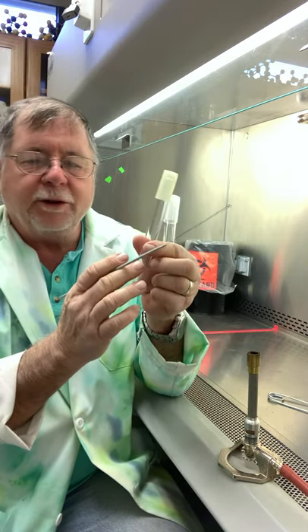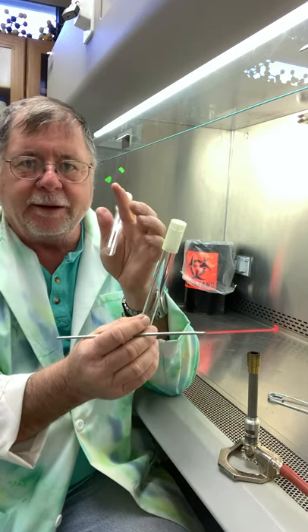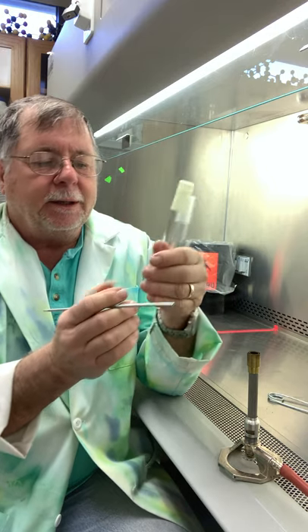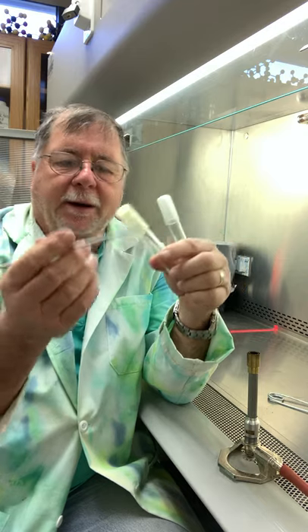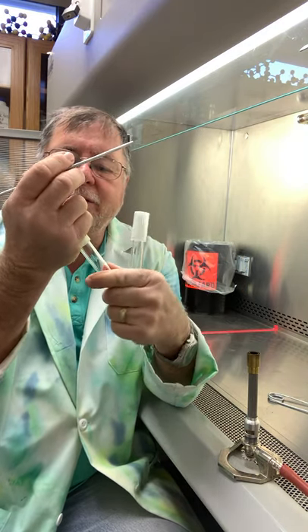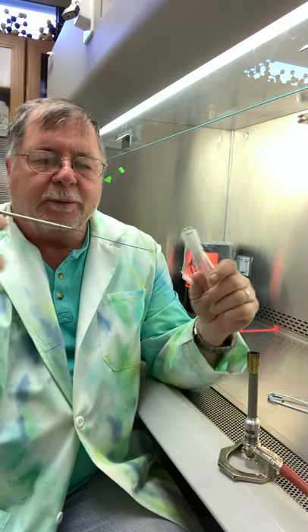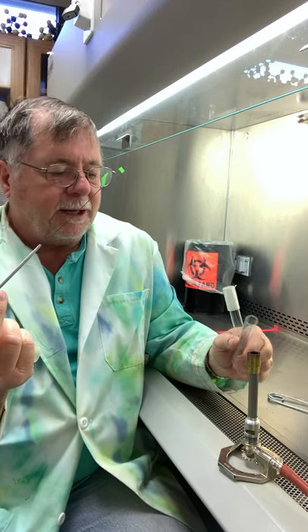This is the original tube. It has bacteria in it, if it was for real. And then this other tube is the one we want to add the bacteria to. It's sterile right now. Okay, so we hold them both in one hand, and we're going to pull the cap off with one finger. The little finger wraps around it, and we twist and lift it up, and that comes off. And then before we go in with this sterile loop, we have to sterilize the tip.